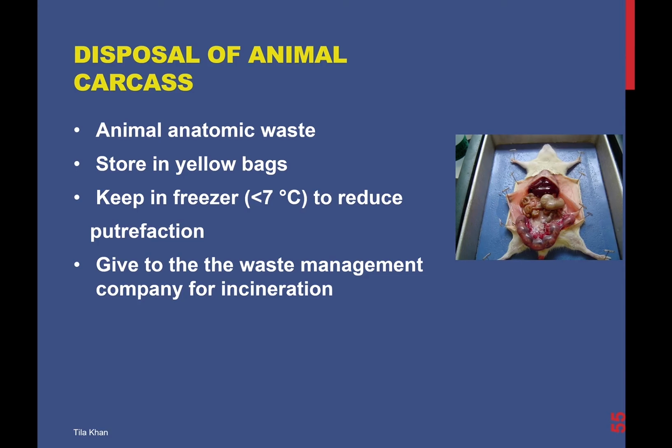Some of us do laboratory animal research, and to dispose of animal carcass or animal anatomic waste or animal body parts, we cannot autoclave these wastes. What we do is we store these carcasses or body parts in the yellow bags, and we keep it in a freezer to reduce putrefaction or decomposition.